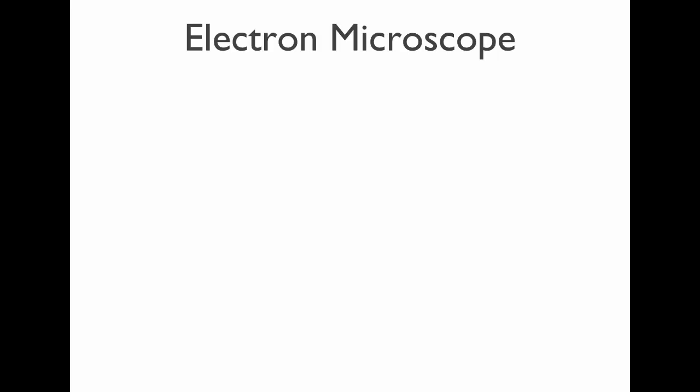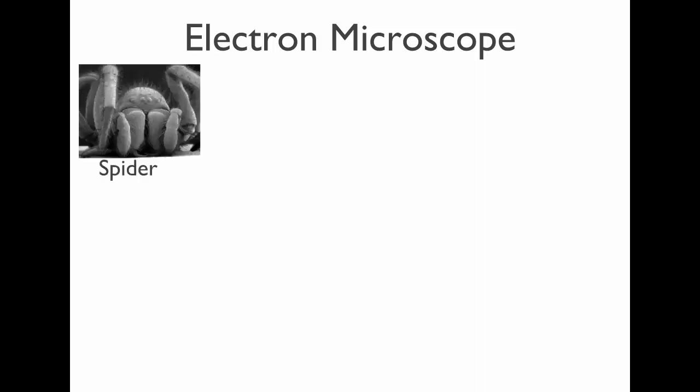Not in that. And then an electron microscope, like I said, we don't have one, but I'll show you some interesting pictures. Because you can get really good resolution and great magnification, you could also see the depth. What you do is you take the object you want to look at, it has to be coated in a metal, so you can't look at anything that's alive. Then you put it on a little mount, and you put it in this little chamber within this sort of thing that looks like a computer, and it shows you the scan on the screen, and you can adjust the magnification and so forth. And so you can see a pretty nice three-dimensional view of the object.